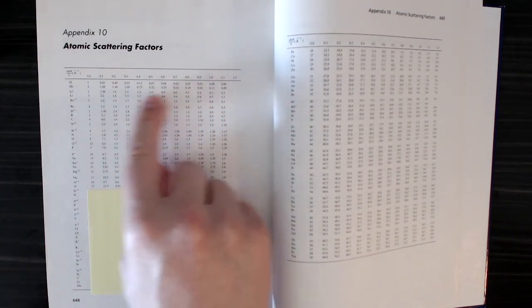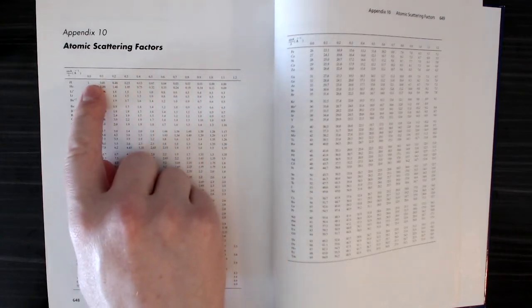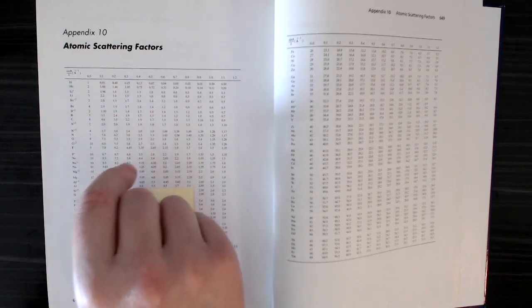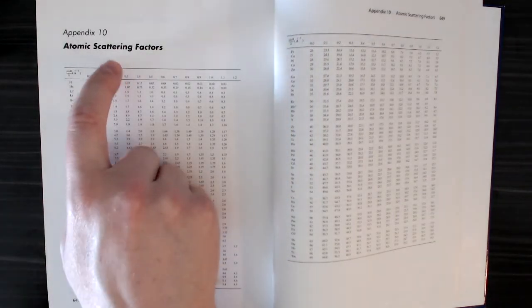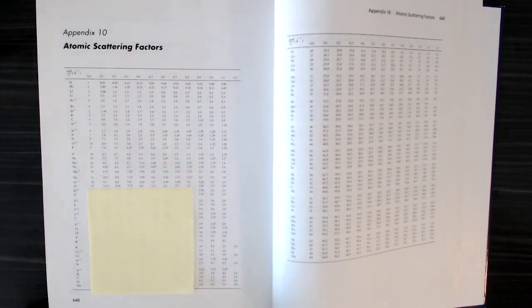So you can use these values. If you're not at 0.0, 0.1, 0.2, etc., you might have to interpolate between these values, but this is a good starting point to determine the atomic scattering factors. So you'll need this for your structure factor calculations.